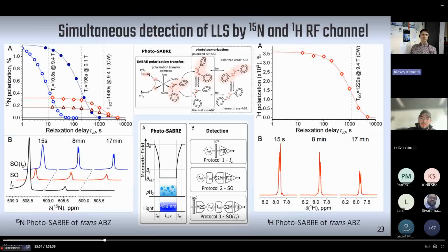It was kind of noisy. Within a single scan, you can acquire one transient, and the important thing is that it should be reproducible, but our setup is actually quite reproducible, and every transient could be started with almost the same amount of polarization. Yeah, it's possible.